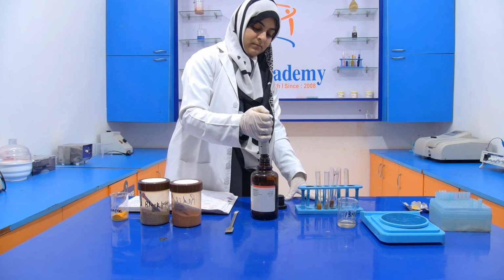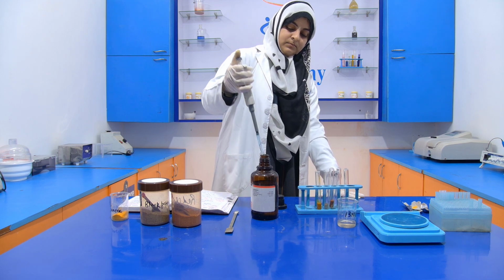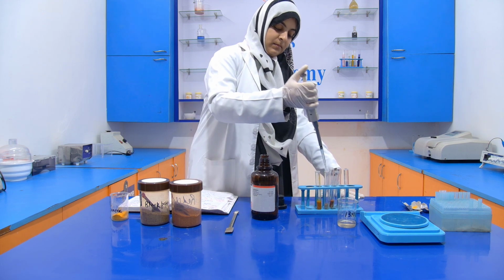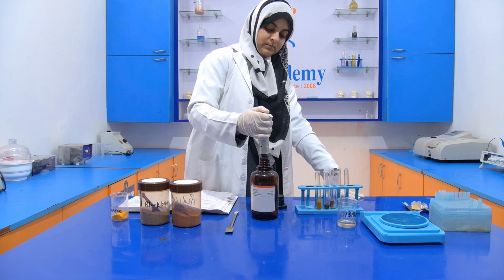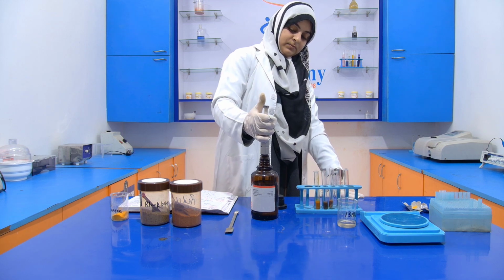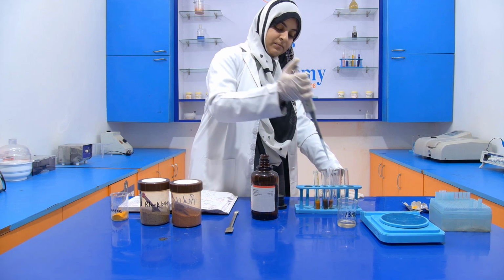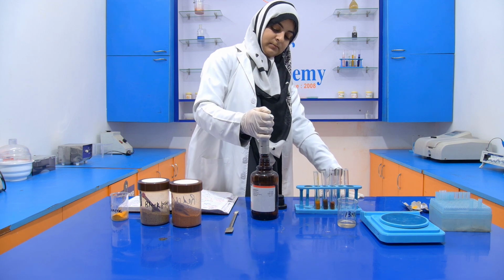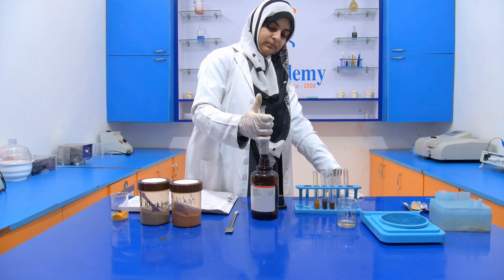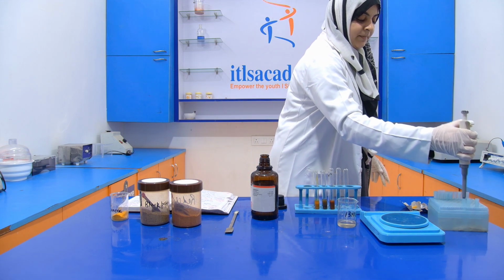Add it to the first, second, and third test tube. Now add to the last test tube as well. Okay, now discard the tip.